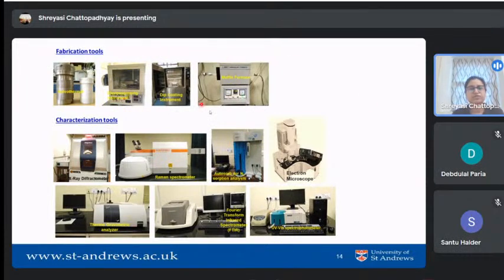And when you have your material, you need to characterize it using some tools. Some of them are very familiar to you, like UV-Vis or IR, even Raman and XRD as well. Raman and XRD are mainly used to characterize the structure or phase of the material we synthesized.